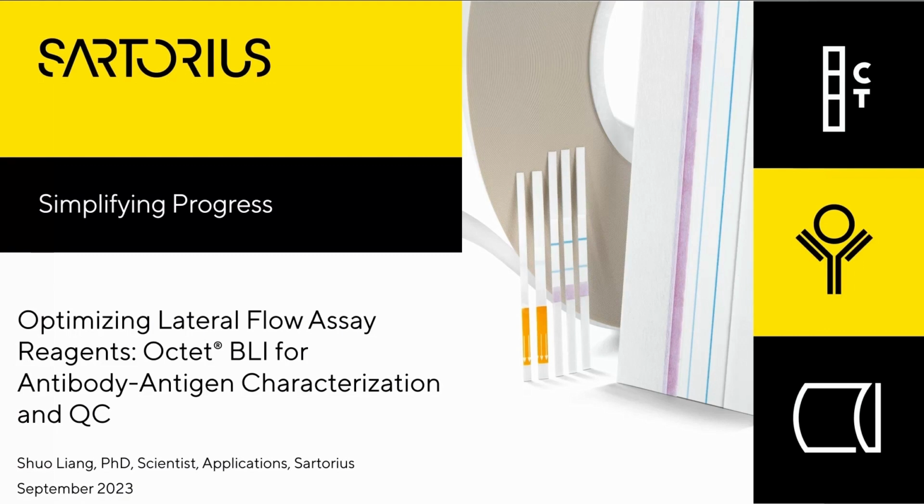I would like to talk about optimizing lateral flow assay reagents, Octet BLI for antibody-antigen characterization and QC for you today.